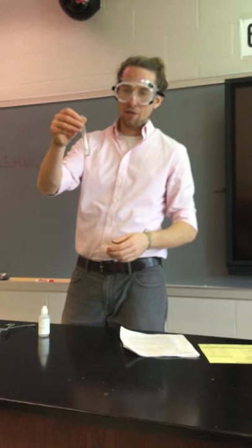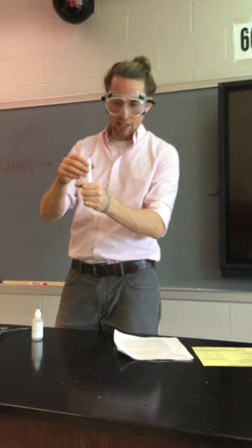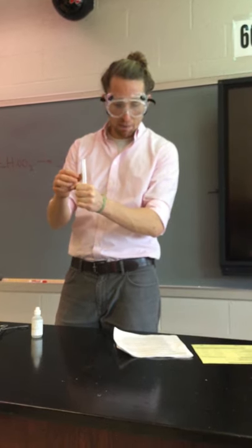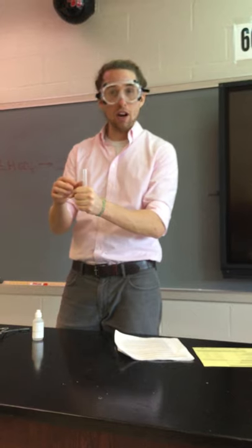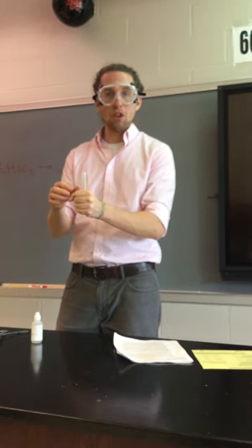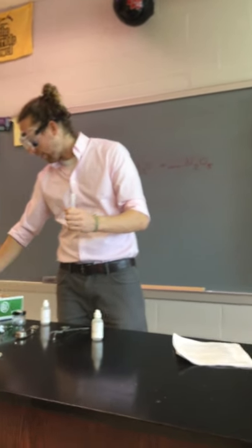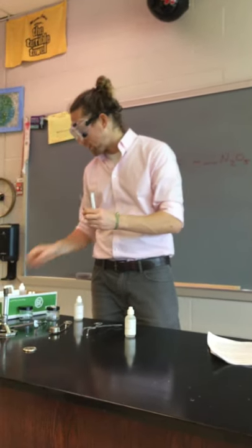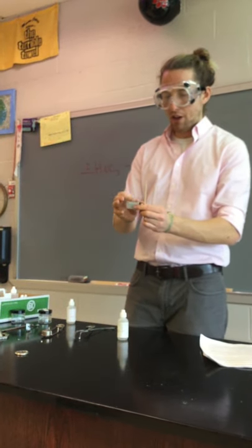All right, so you can't really see that well, but it is fizzing. While that's going on, I'm actually going to feel this thing and see if I feel anything happening. We're looking for either exothermic or endothermic, and I actually am feeling a little bit of heat being given off. Now, while this reaction is still going, I'm also going to light up a wooden splint. And the reason for the wooden splint will become evident shortly.